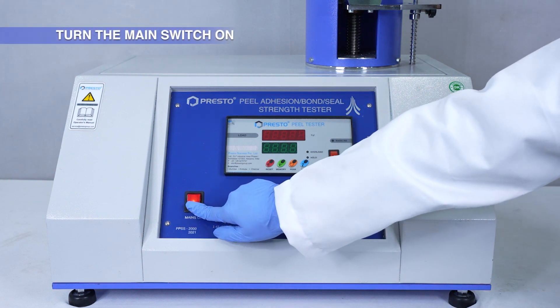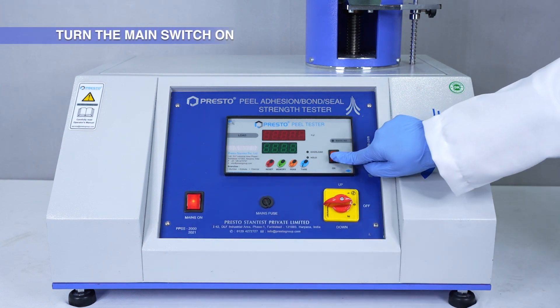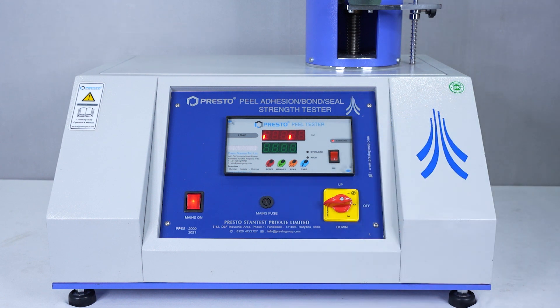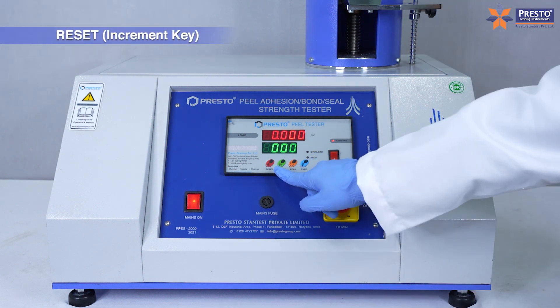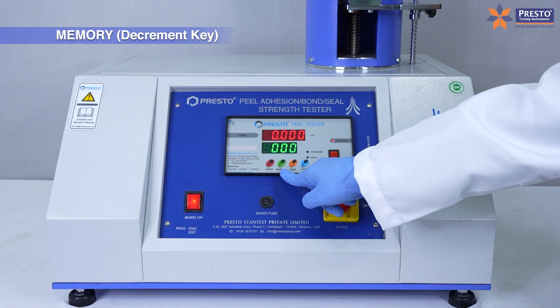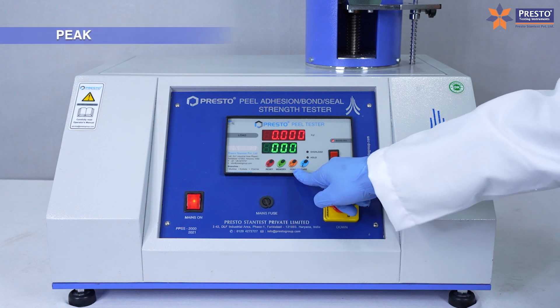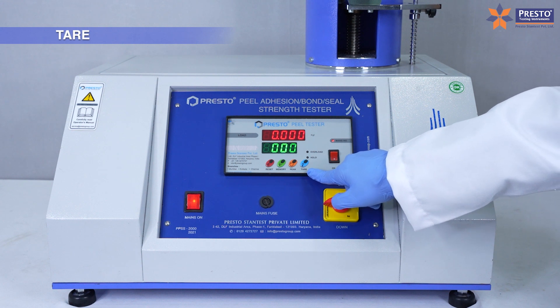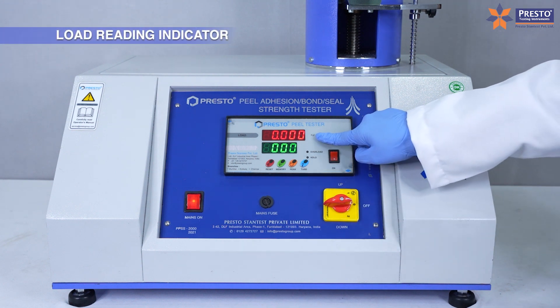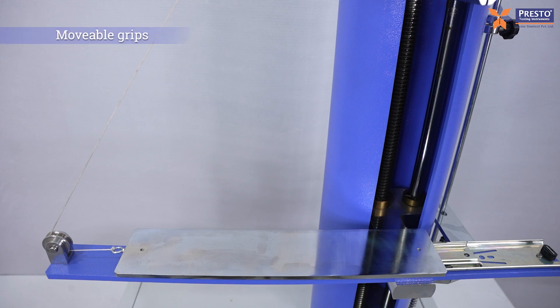Turn the Main Switch on. Key controls include the Reset, Increment Key, Memory, Decrement Key, Peak, and Tare. The Load Reading Indicator and Moveable Grips are also key components.